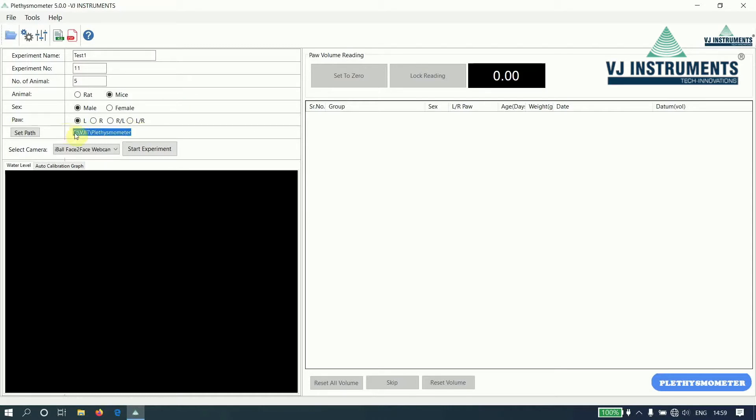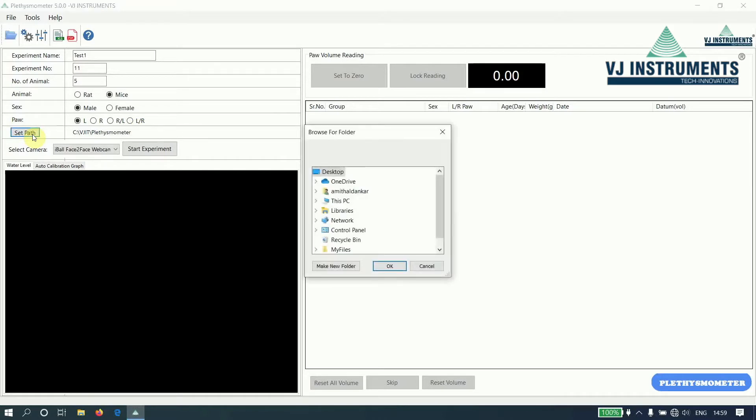This is the path wherein the reports will be saved. By default, it is set to C VJIT plethysmometer. If you wish to change it, click on the set path button. A folder dialog will appear. Select the required folder and click on the OK button.